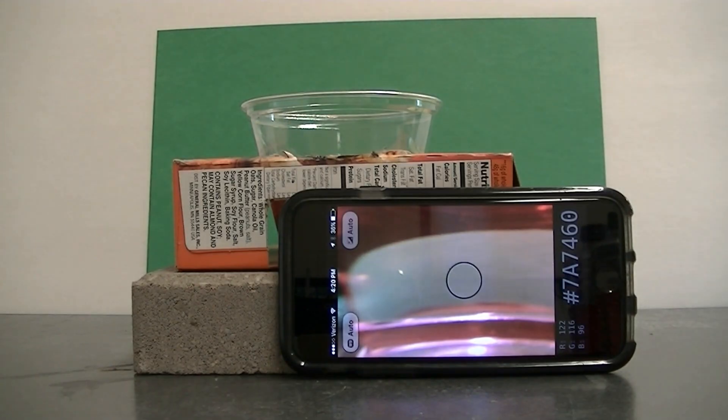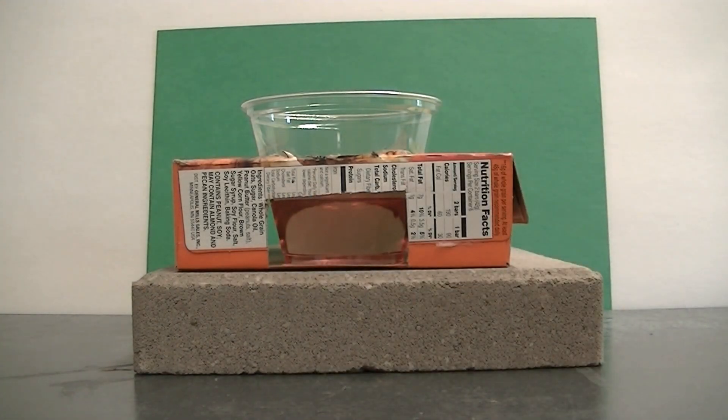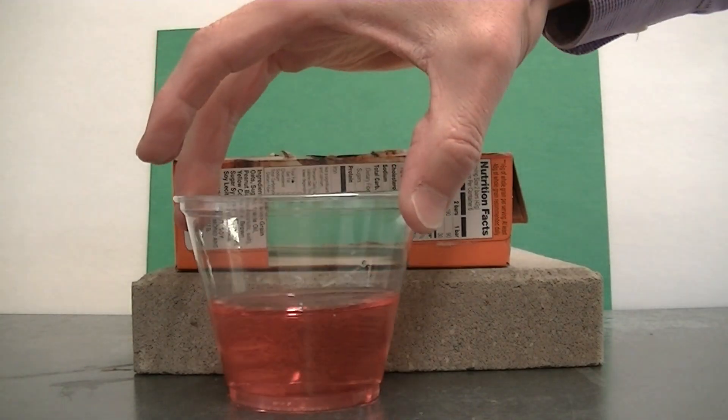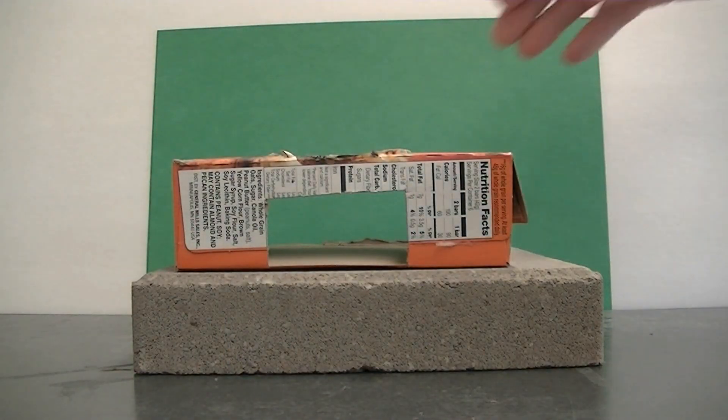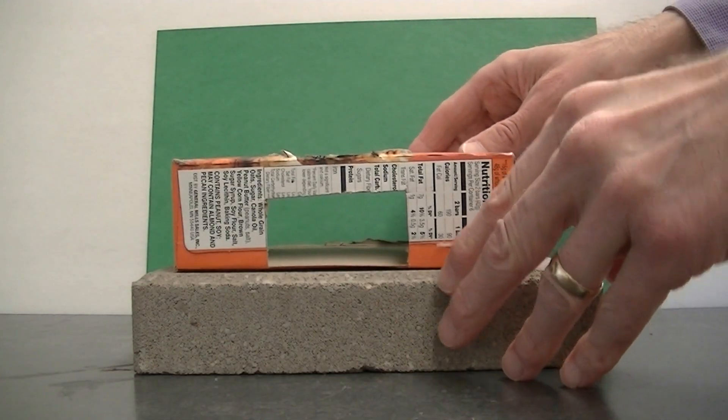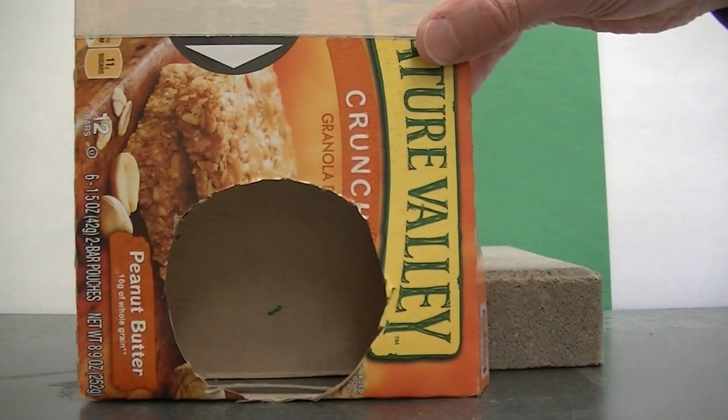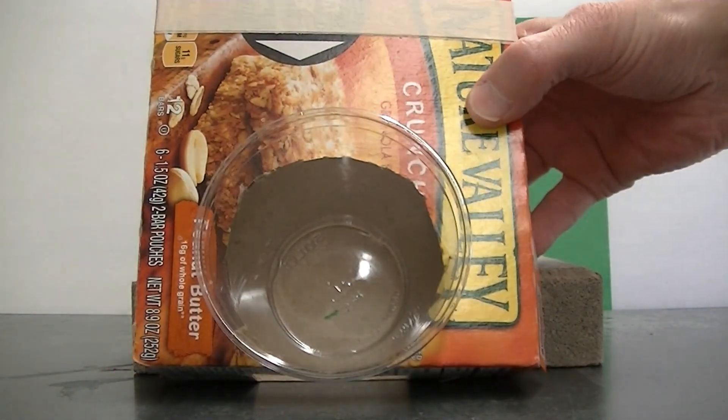I'll show you how to get this set up so that you can take some pretty good measurements. The first thing that you'll need to do is to decide what you're going to use to hold your samples. And what I've chosen is simply a Solo plastic cup. Once you've decided what you're going to use for your sample holder, you'll need to cut a box that can hold your samples. And what I've got here is my box with a hole cut in the front so a Solo cup can fit rather snugly in it.